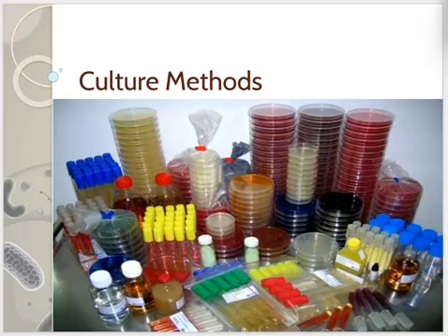Let's start by looking at culture methods, which are essential in microbiology for growing and studying microorganisms. These methods use various types of culture media to support microbial growth under controlled conditions. The different media come in many forms, like petri dishes, test tubes, and vials, with colors and compositions tailored to specific purposes. Understanding these basics sets the foundation for exploring how we cultivate and analyze microbes effectively.